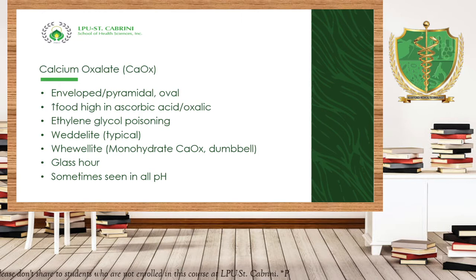Okay? Typically, calcium oxalate is weddellite and whewellite. Kapag po weddellite, that is the envelope shape. Envelope shape, weddellite. Makakatandaan naman. Weddellite, envelope shape. Whewellite, ang papanghe. Whewellite, that is the monohydrate calcium oxalate, and that is our dumbbell shape.